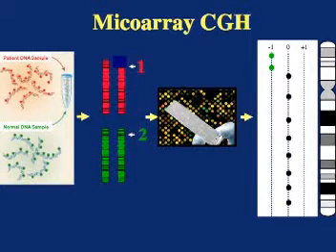The DNA in this mix of normal and patient DNA then compete with each other to attach to those spots on the slide. Then the slide is scanned by a laser reader that measures the level of red and the level of green fluorescence attached to each of the microspots and compares their ratios. In the example shown here, every place at the end of the chromosome 18p arm, there are two green for every red. So more green will attach to those spots on the slide from the end of the p arm. And the spots in the slide will be more green than red.